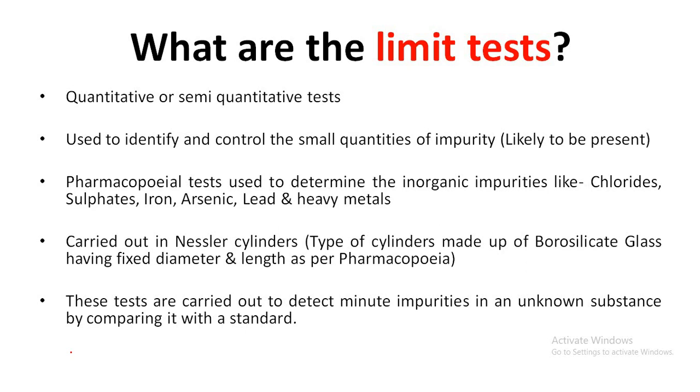So before going for the limit test for chloride, it is very necessary for all of us to understand the meaning of the limit test. What are the limit tests? Limit tests are basically quantitative or semi-quantitative tests, which are used to identify and control small quantities of impurities. As we know, what are impurities?